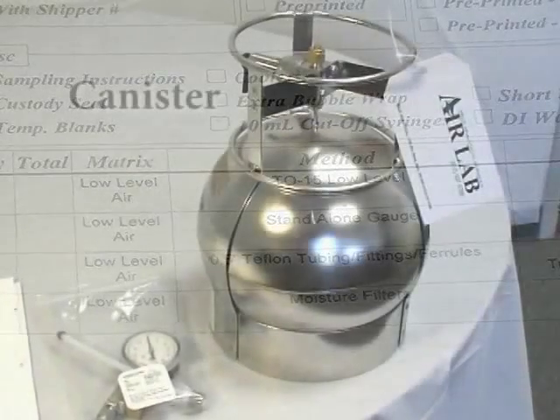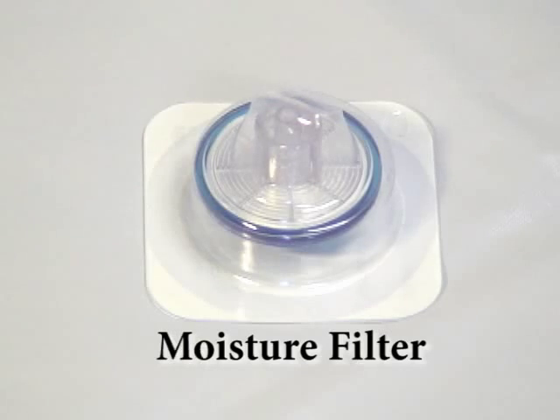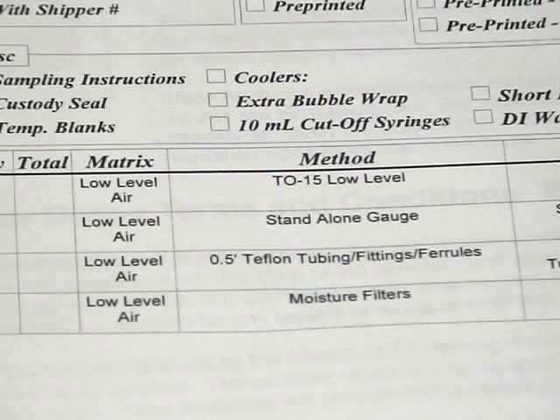Proper inspection is best achieved by using the packing slip or bottle order as a reference list. Today we see that our bottle order is for one canister, with tubing, fittings, ferrules, moisture filter, and a stand-alone gauge. Take some time to compare the contents of the box with the packing slip and be sure to notify PACE of any discrepancies.